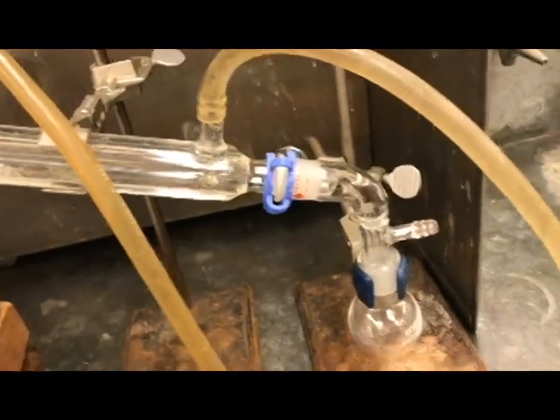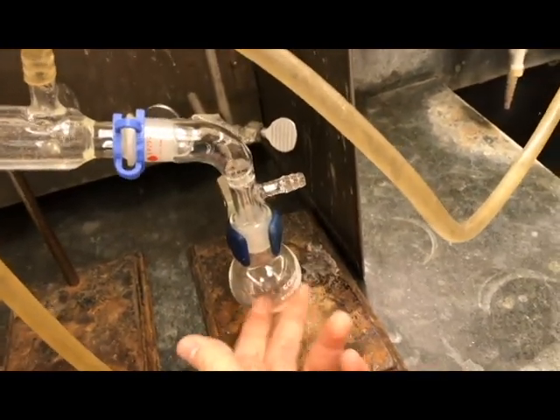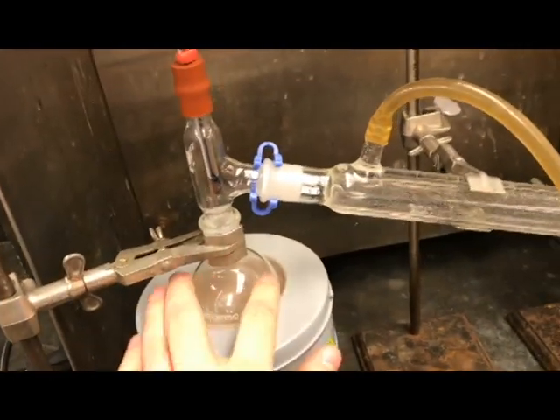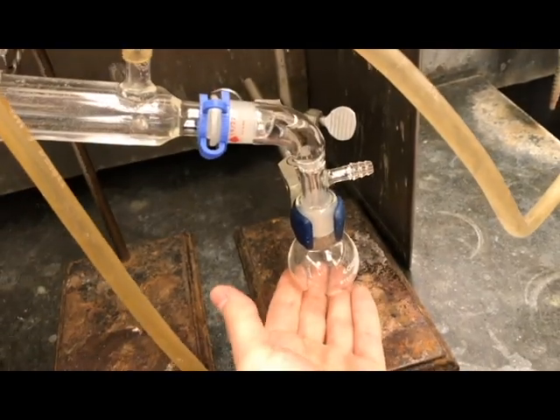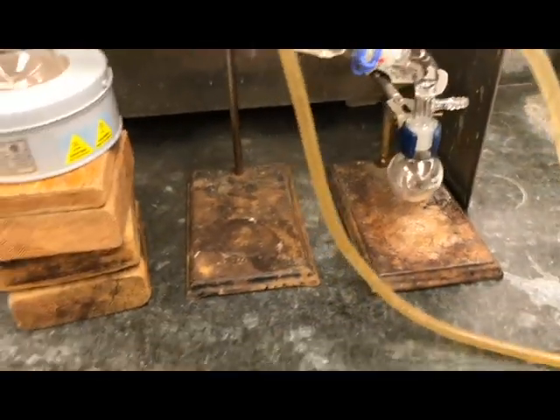After the condenser, we have this little vacuum adapter that hooks onto our flask here. While you're running the reaction, this is going to evaporate, condense, and then your product will fall into here. And we'll have some further steps to go after that.